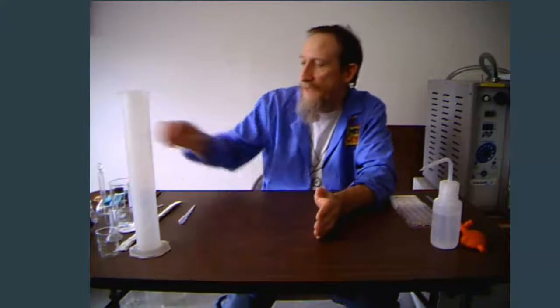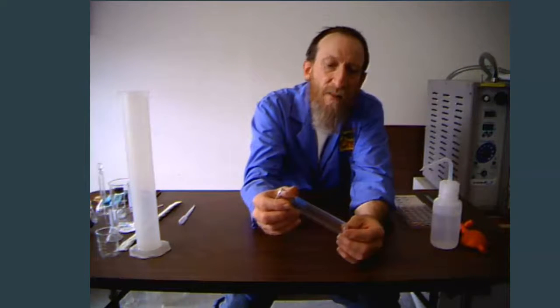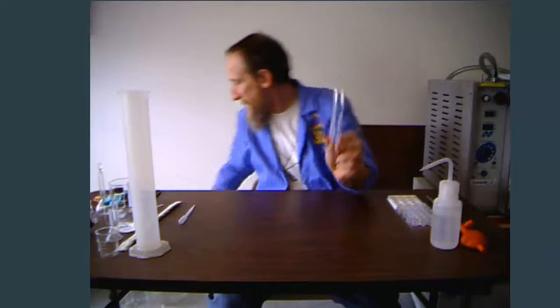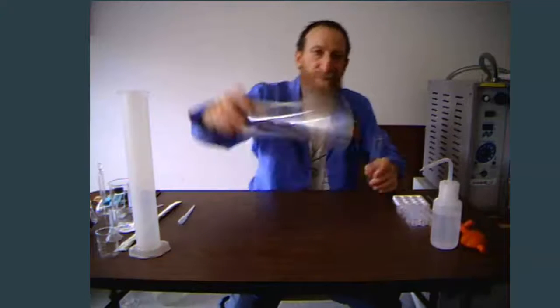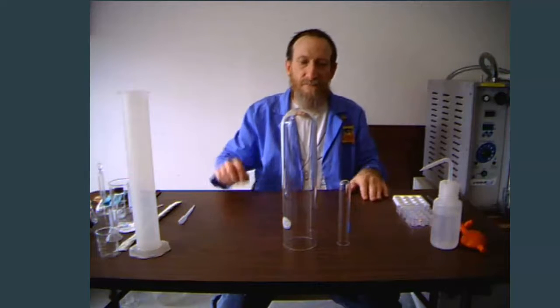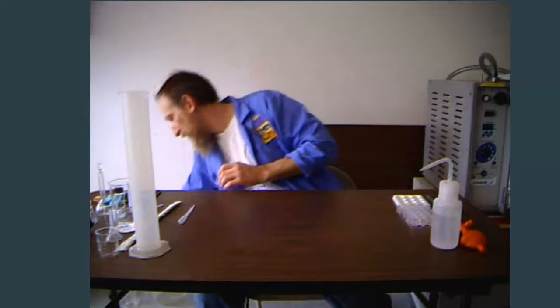We skipped the most basic of all laboratory glassware: the ubiquitous test tube. Test tubes come in all various different sizes, depending on the function and how large a test tube you're going to need. This is our standard size test tube, and then there is our kicked-up, extra-large test tube. I will be making a video using this one in a future upload.